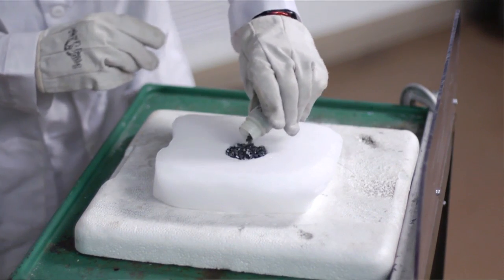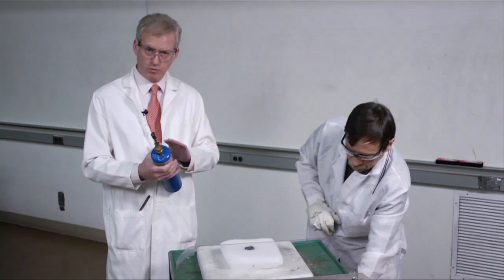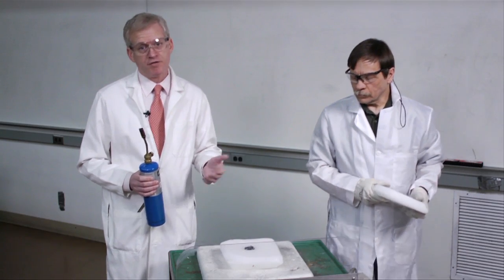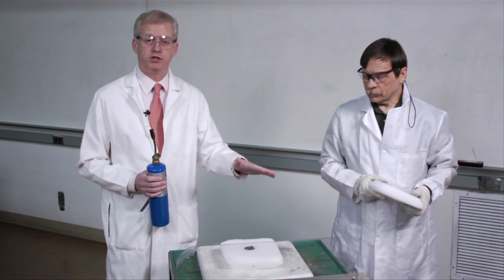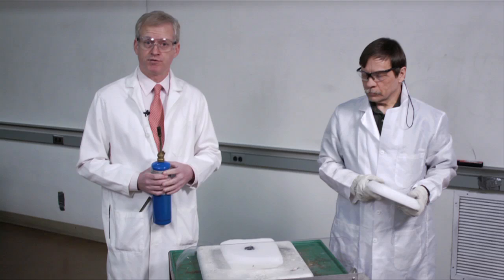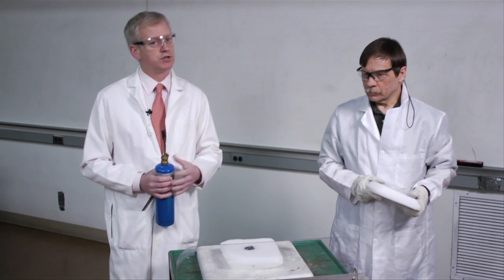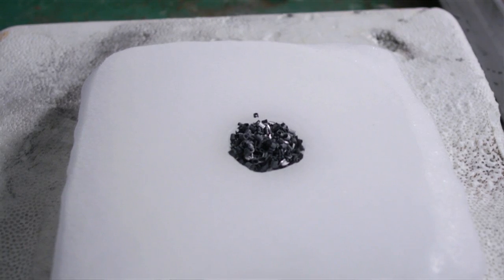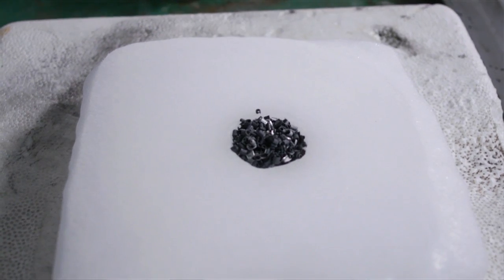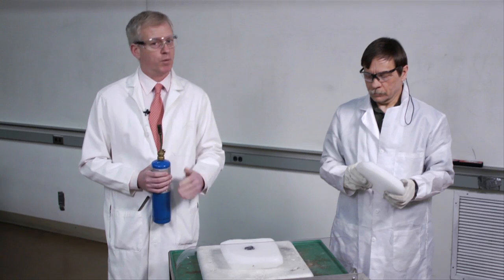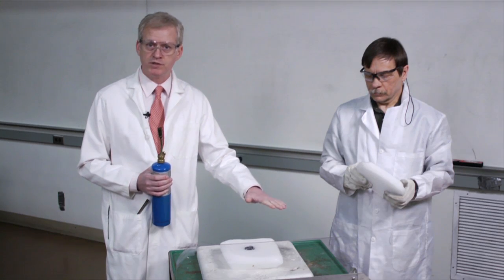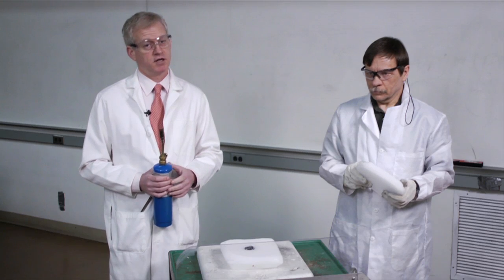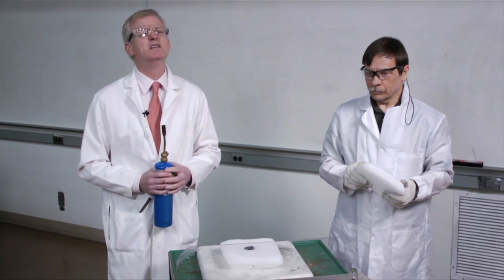In a moment, I'm going to light those shavings with this torch, at which point they'll begin to burn in the air. To begin with, they'll actually react with oxygen in the air, as that too is an exothermic reaction and the oxygen is readily available. However, we're then going to cover the burning magnesium with another slab of dry ice, and once all the oxygen is consumed, the magnesium is going to begin burning the dry ice, in a fashion that is reasonably dramatic.